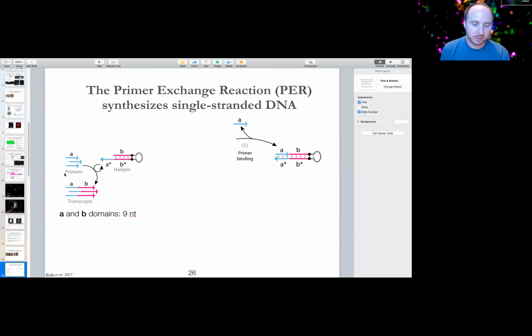So say, for instance, we have what we're going to call a primer molecule, which is species A. In this case, this is a 9 or 10 base single-stranded piece of DNA, very similar to a PCR primer, but a bit shorter, that does have that 3' hydroxyl that's needed to continue to extend the sequence further, potentially, if it sees a polymerase. And we're going to put that into solution with this hairpin here.